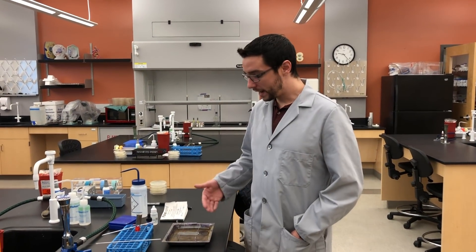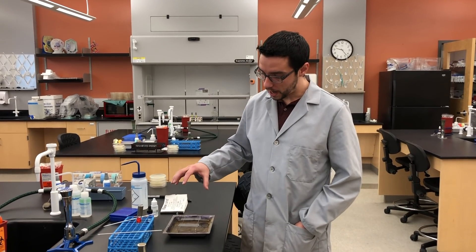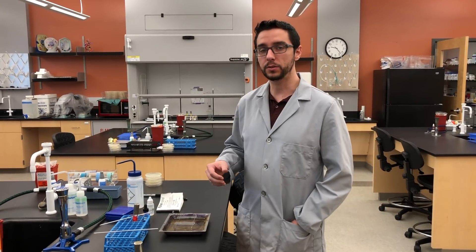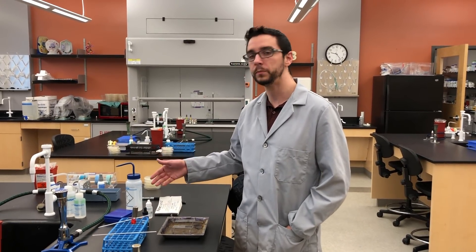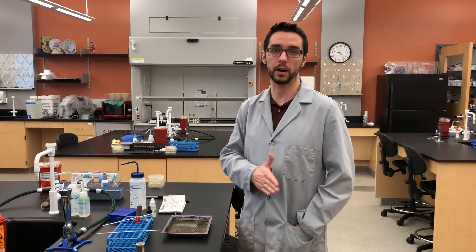We're back. We have had our bacterial cultures evaporate dry on our slides, and now what we want to do is heat fix them. The reason why we want to heat fix them is to secure them to the slide, so that as we add more liquid — such as the stain — and then rinse the stain off with water, the bacteria are less likely to fall off the slide.